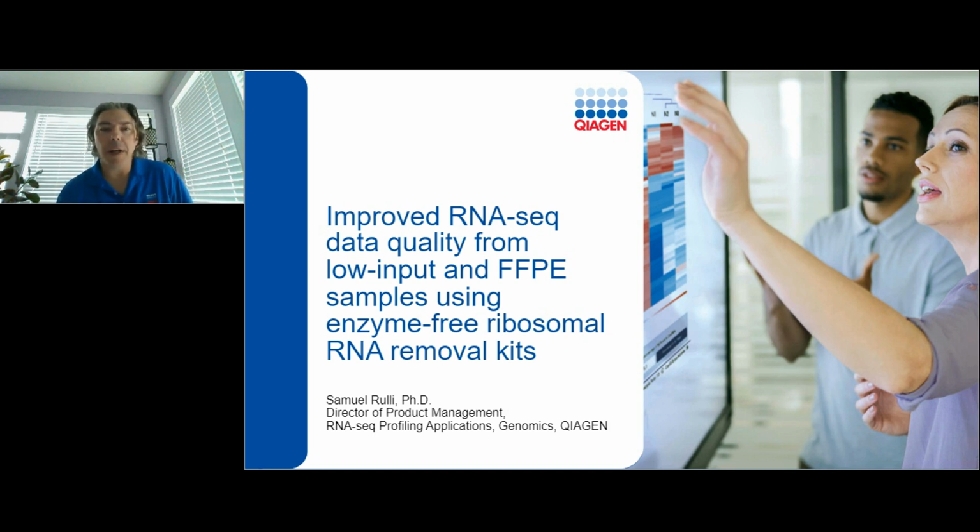Today I'm going to focus on trying to improve data quality using a method that we developed here at QIAGEN for removing ribosomal RNA or globin RNA or any unwanted RNA from your sequencing experiments. The reason why we like to remove unwanted RNA is a couple of different things. The first is if we have a highly expressing RNA like ribosomal RNA, which doesn't provide any biological knowledge to us, removing that can allow us to see lower expressed genes with the same amount of input. And this becomes really critical if we have limiting amounts of sample.